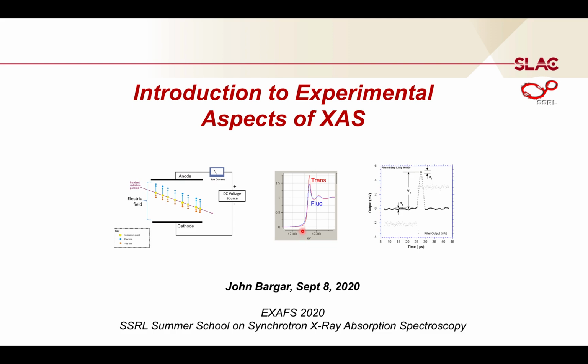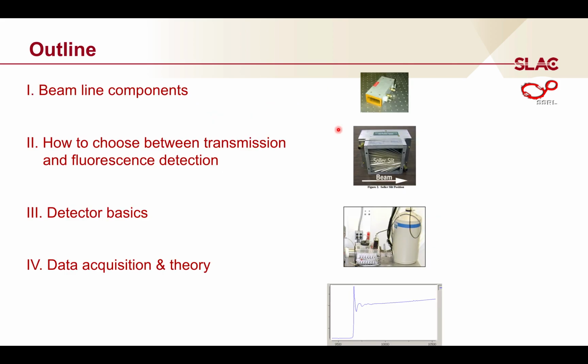I am a senior scientist at SSRL, and I will be talking to you today about an introduction to experimental aspects of X-ray absorption spectroscopy. There are four major sections that I will be talking about today, which you see here. And what I've done is I've recorded each one of them as a separate video so that it's easy to go to each one, start at the beginning of just that section and play it.